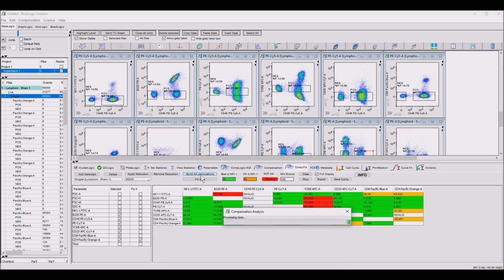So it's compensating from positive and negative by calculating the delta and meeting the best possible delta MFI. And you can see it's very quick. The process is not complex, very easy, and it's very quick to start to adjust the data.